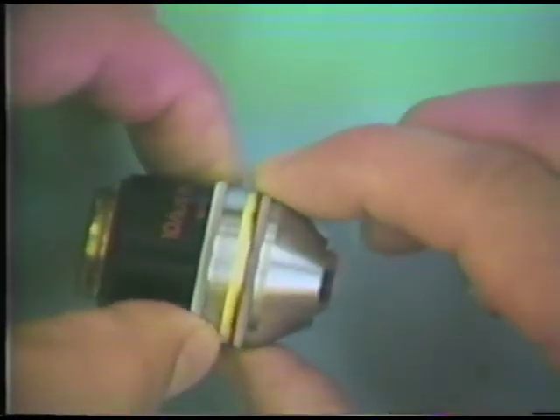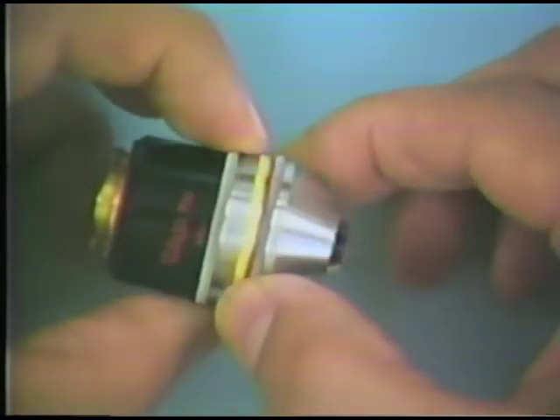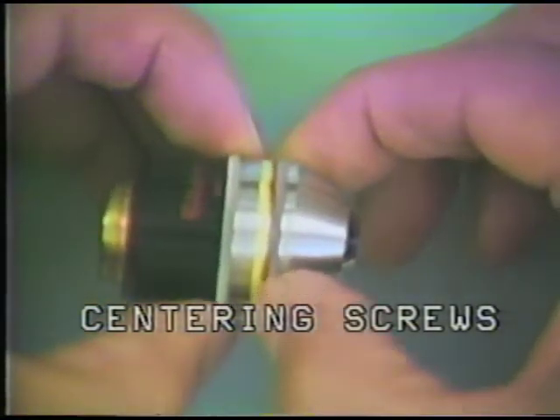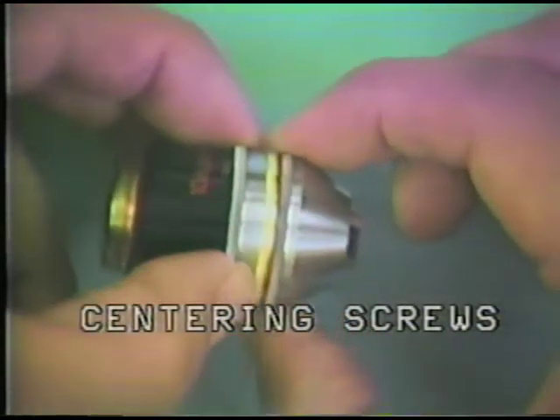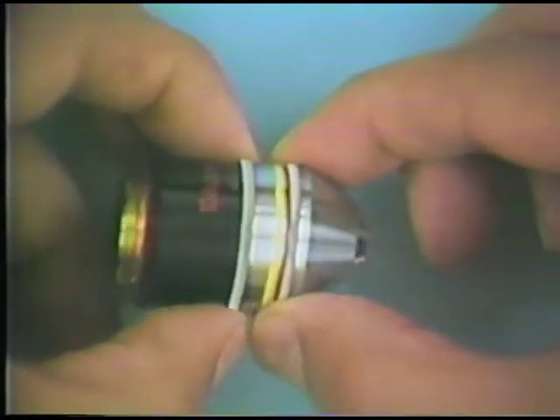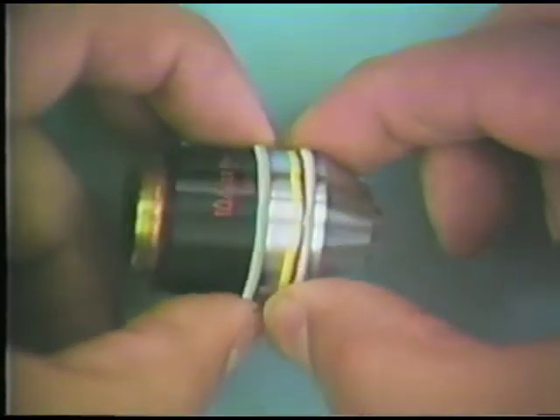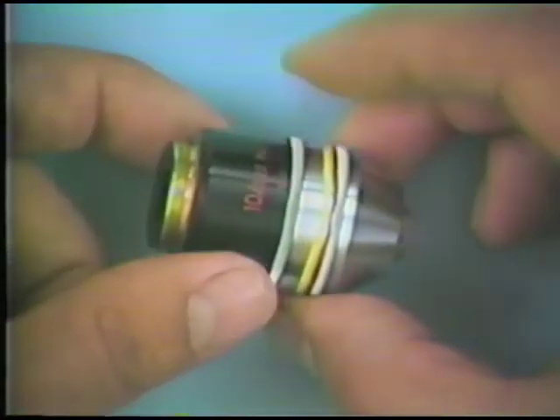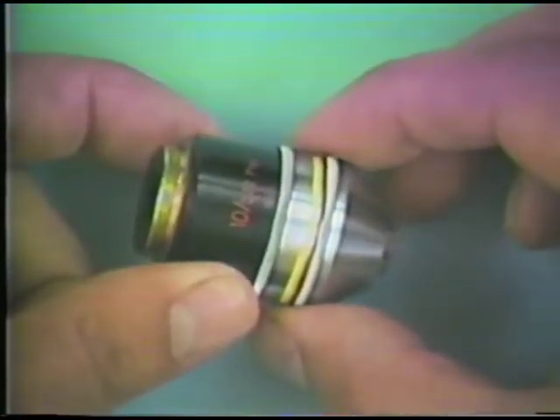There also are two centering screws on this objective. I've obviously removed this one from the turret just for demonstration, but I'll also demonstrate the function of these centering screws and why we need them. They're required to center the objective so that what we're looking at remains in the center of the field of view. You can see also that there's a screw fitting where the objective screws back into the turret of the microscope.